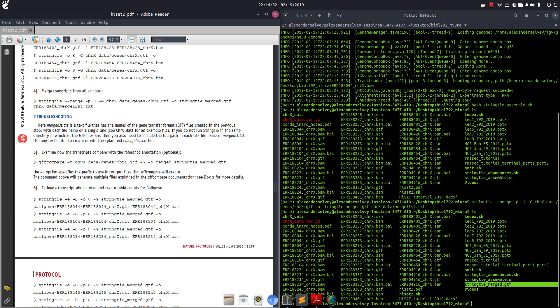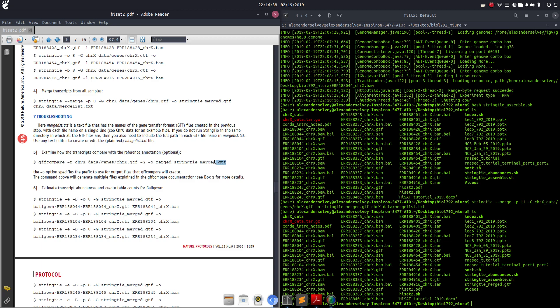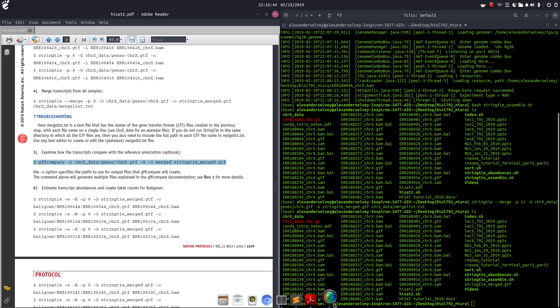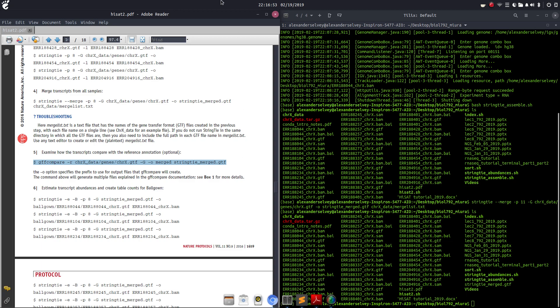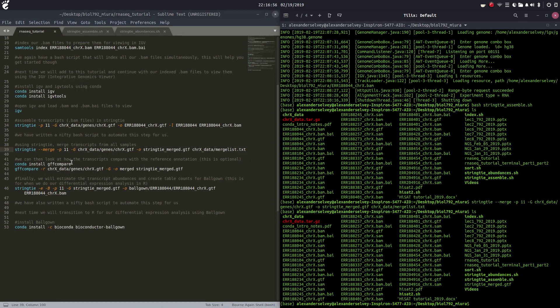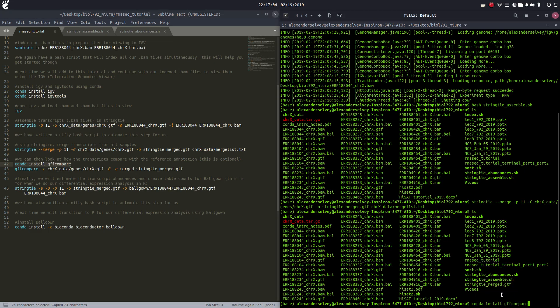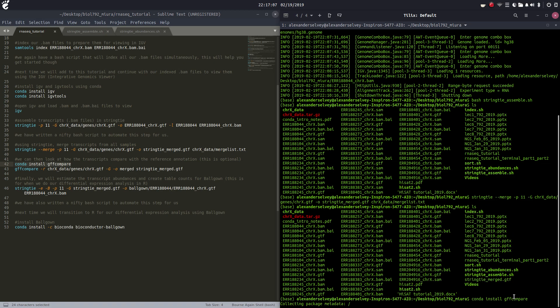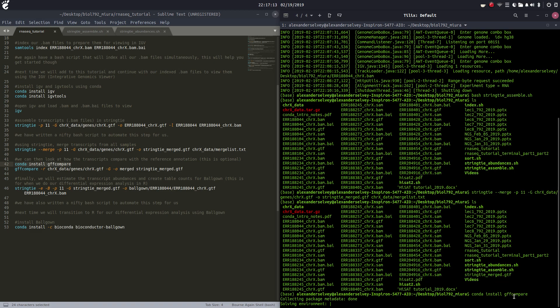This is the part of the tutorial where we can examine how the transcripts compare to the reference annotation. We're going to get a bunch of output files, but for our purposes we'll be looking at the annotated GTF file and the stats file. Let's generate these files. This is how you install gffcompare: conda install gffcompare. It's going to do its thing. Like I said before I've installed all these previously, and I'm just reiterating this for learning and teaching purposes.